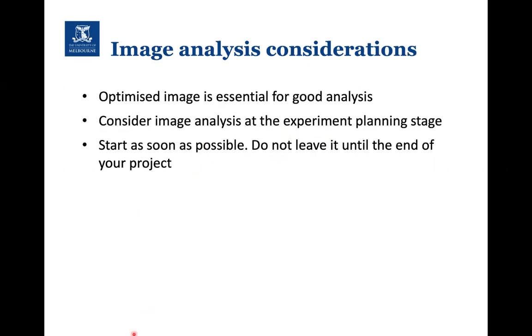Every year we have examples of honors students coming to us who've acquired all their data and they want to do a specific type of analysis, but they haven't acquired it in the right way. So you can't really use it for the purpose they needed it for. And it's because they didn't think of what they were doing before they started the experiment.